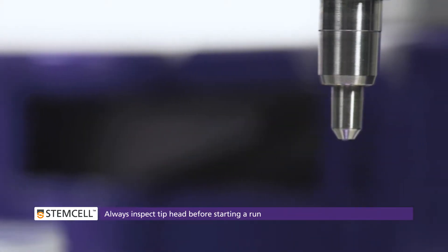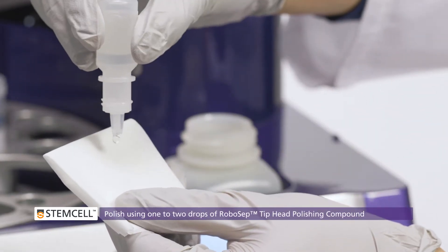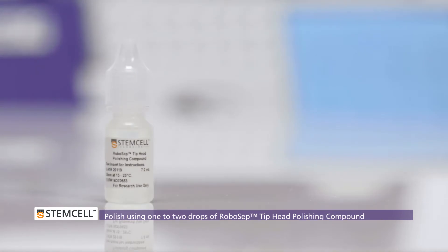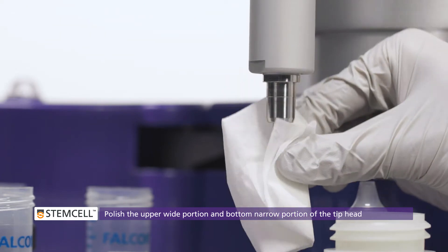Always inspect the tip head before starting your run. To polish it, apply only 1-2 drops of RoboCEP Tip Head Polishing Compound to a clean Kim Wipe. Polish the tip head by wiping in a downward motion several times.